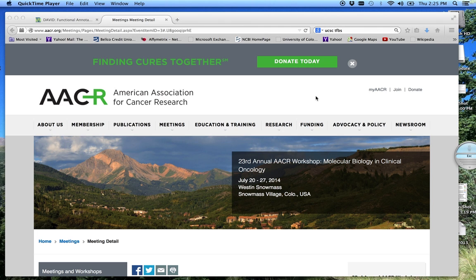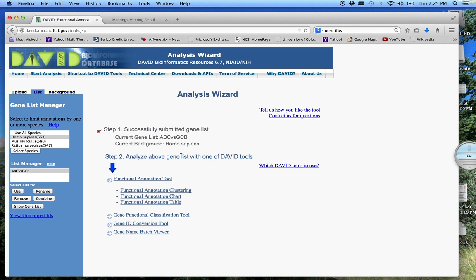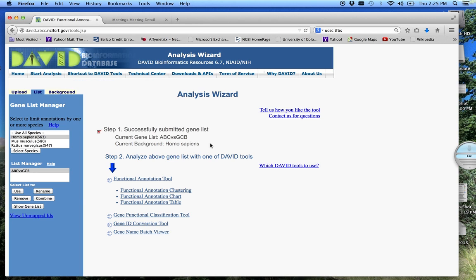This is part three of the DAVID Bioinformatics Resource Tutorial. This is done in conjunction with the AACR 23rd Annual Workshop held in Snowmass, Colorado in 2014. In our first tutorials, we looked at how to download data, or our gene list, into DAVID.